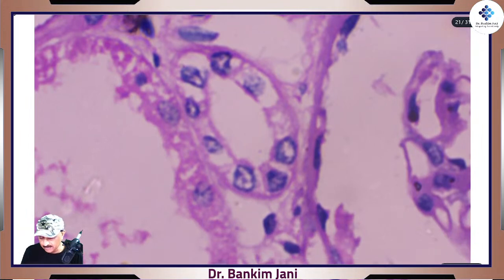See this. This is 100x magnification, where we really see those flat nuclei. Now, if you are watching those flat nuclei, you will definitely be tempted to look at these, which are quite different.